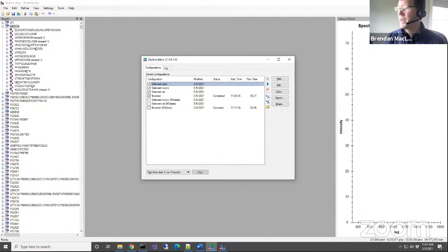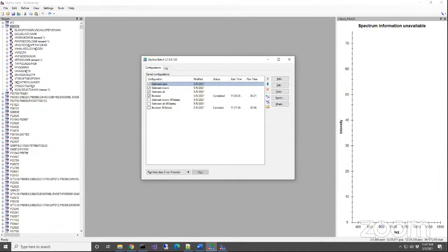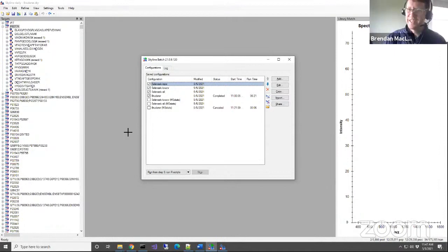How can we tell which IRT peptides were closer to our peptide of interest, when parameter characteristics shall we look at, closer retention time? I'm not entirely sure what this person meant. I don't understand that one.